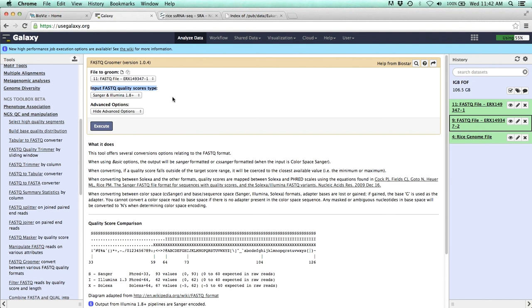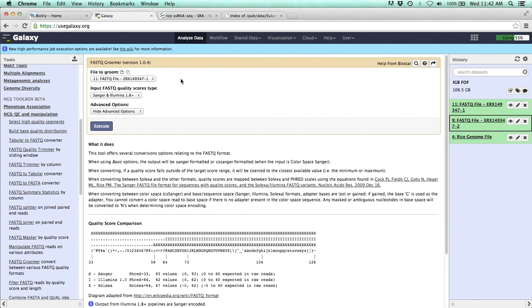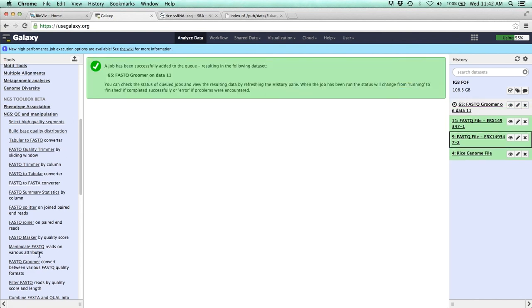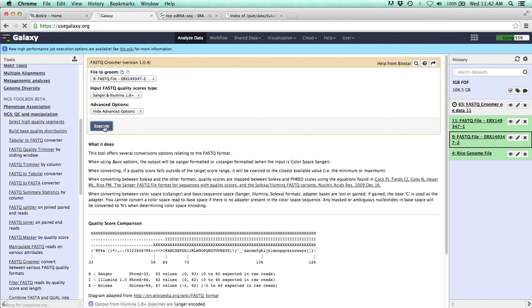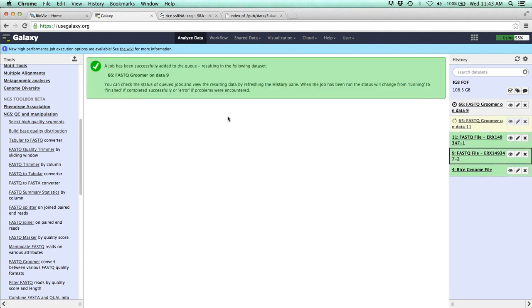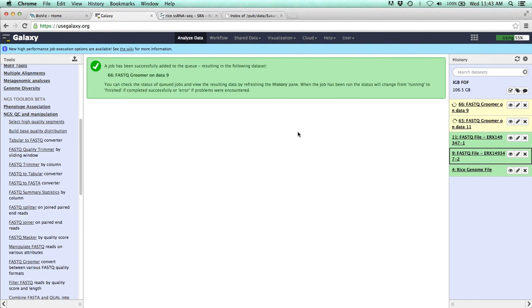Otherwise, you can look at the FastQ file itself, like we just did. And depending on that top line, how that's organized, that can sometimes tell you which version this is. And then the third option is to use a tool that we're going to use in just a moment called FastQC. And this is a quality check tool. But what it also does is it will tell you what format your FastQ quality scores are in. So we'll go ahead for now, though. I know it's in 1.8 plus, so I'll go ahead and execute that. And then we need to make sure we do that for both of our paired-end reads. So I'll go back and it should be number two. And so you see this groomer starts right away. Now this groomer will also take quite a long time.